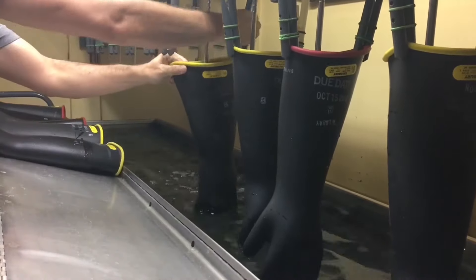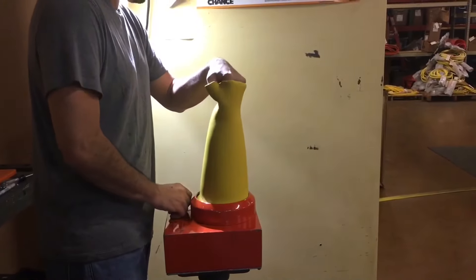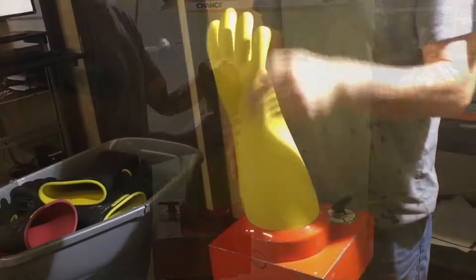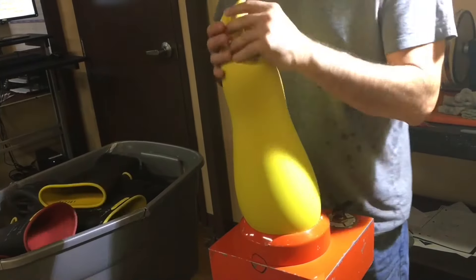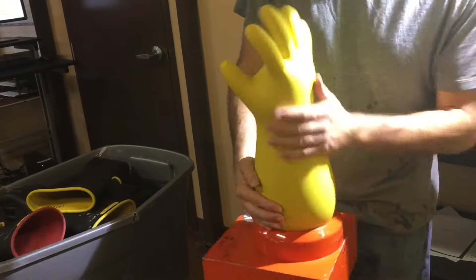The gloves are then dried a second time. Gloves that have passed dielectric testing are then moved to our inflation area where visual inspection is performed. Compressed air is used and regulated to ensure that gloves are inflated to ASTM specifications and not overinflated.